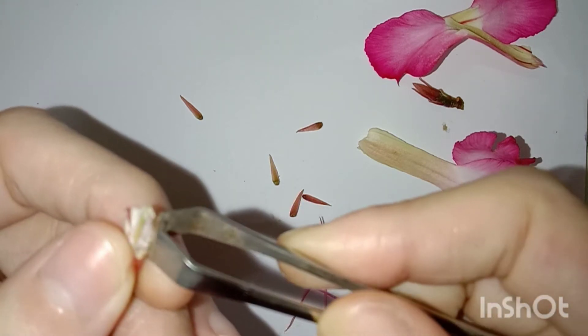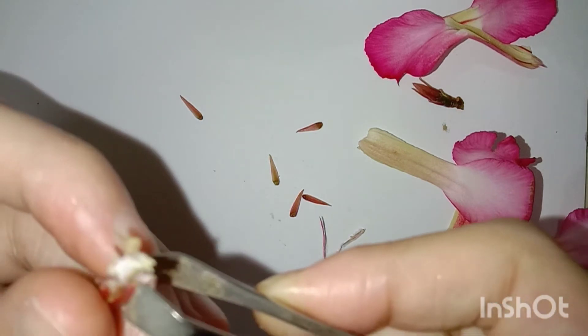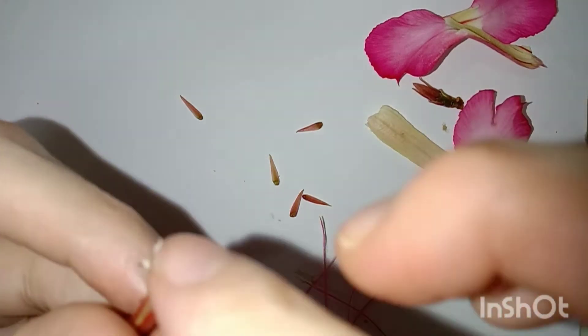And I will tear off the filaments in the center and cut this in the middle. And cut the sand. I will tear off the filaments with the inom leaves.